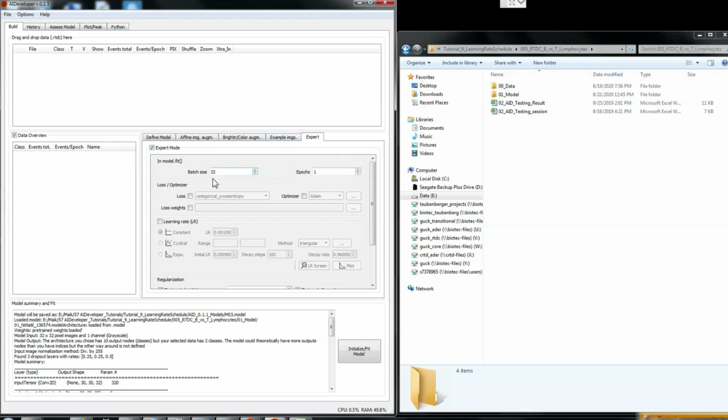You can see here that you can change the optimizer and the learning rate, and this is actually what I want to talk about today. Here, for example, we have the optimizer Adam selected by default, and if we change that, let's say, to AdaDelta, we can see that there's a pop-up telling me that the learning rate was set to the default for AdaDelta, which is now 1. So now the learning rate is 1, and for Adam, the learning rate is 0.001.